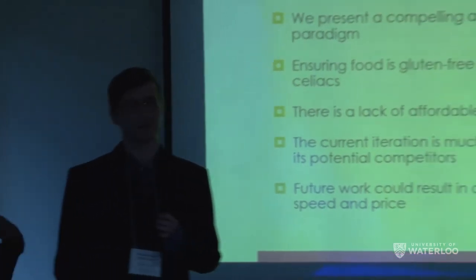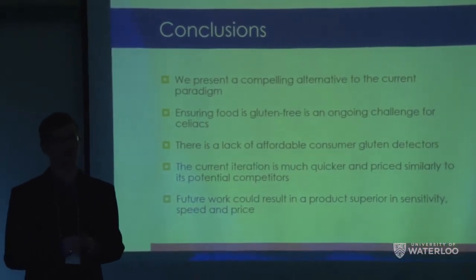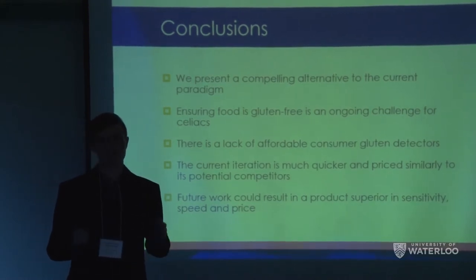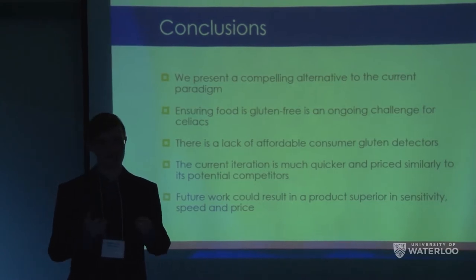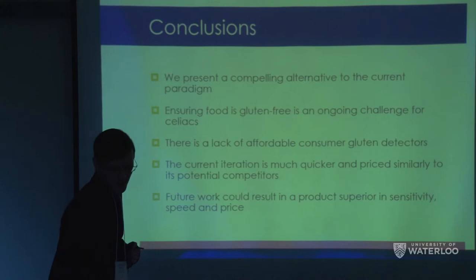So to sum things up, everyone we've talked to with celiac disease or who is unable to consume gluten agrees that the current paradigm just isn't acceptable to them. It's a continual challenge for them to ensure that their food is gluten-free. We've presented a sensor that's very competitive in terms of price and is much faster than any other options on the market. Future work would allow us to deliver something that's both cheaper and faster than anything else.